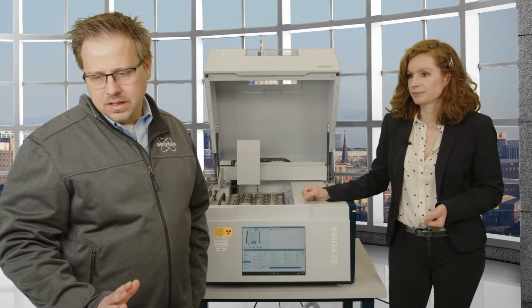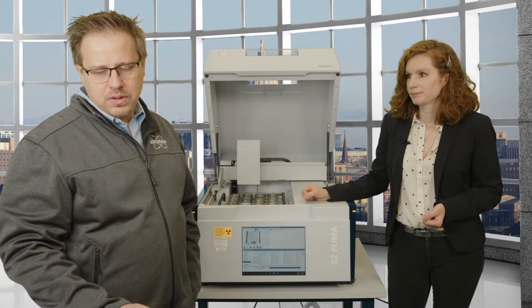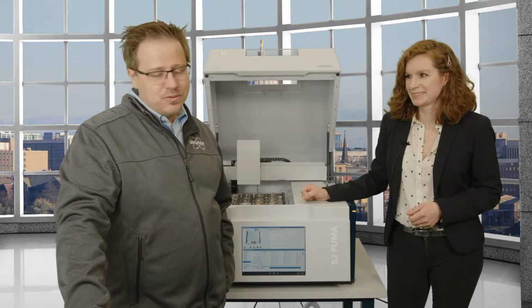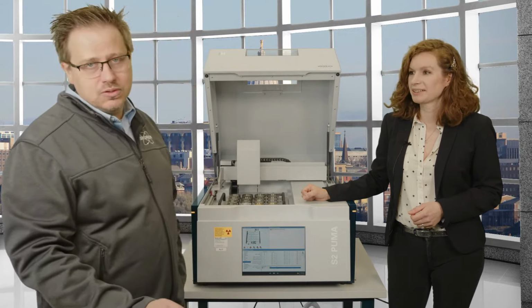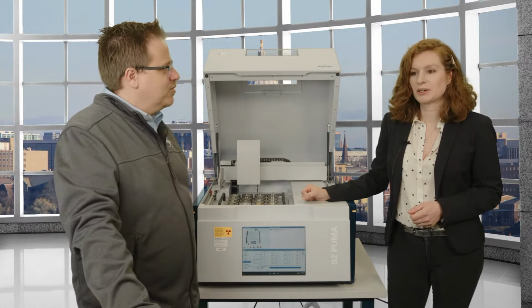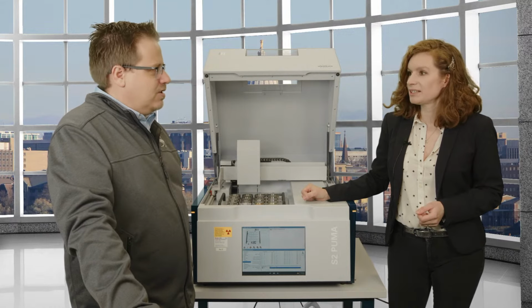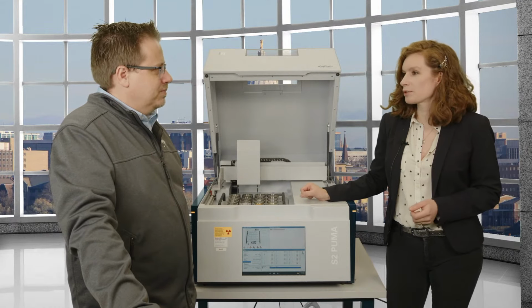So a whole bunch of different machines. And then the last question that we have here, from Susan: I have an EDS. Will XRF work for me? Probably. The difference of those is what goes in. EDS is also energy dispersive spectroscopy.